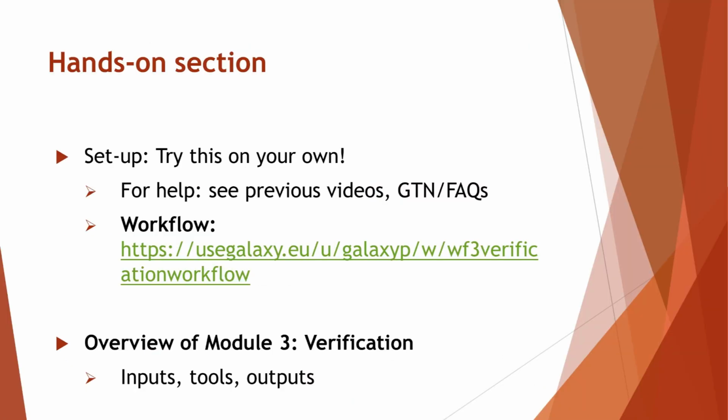Next is the hands-on section. For this video and the remaining videos for modules 4 and 5, I will skip over much of the setup since we use the same one for all modules. If you are unsure about whether you've imported everything correctly, I will show how to put in the input data and start the workflow on the next slide.